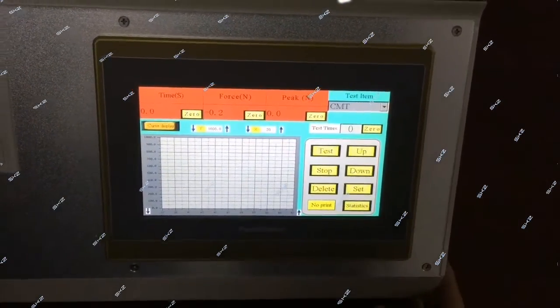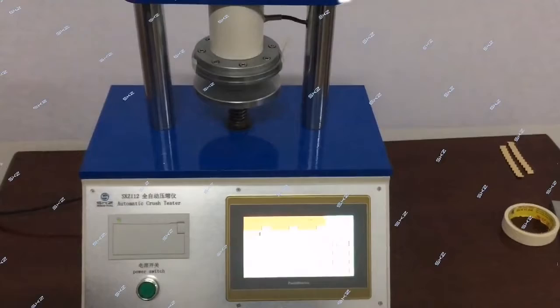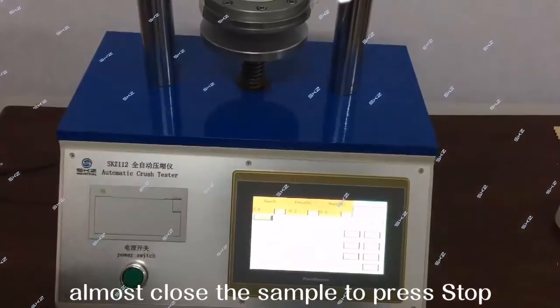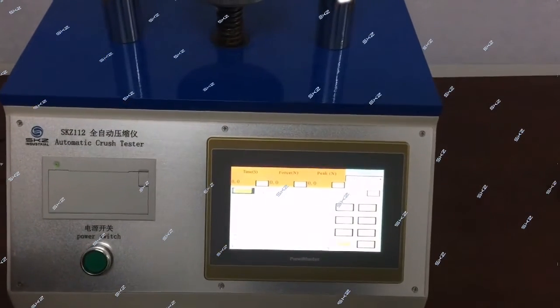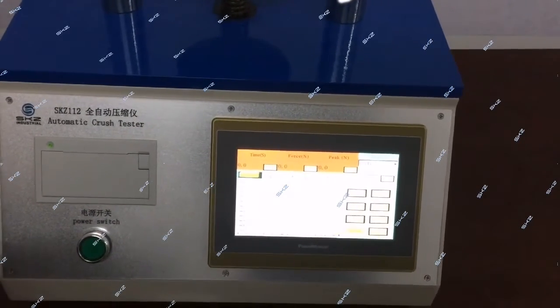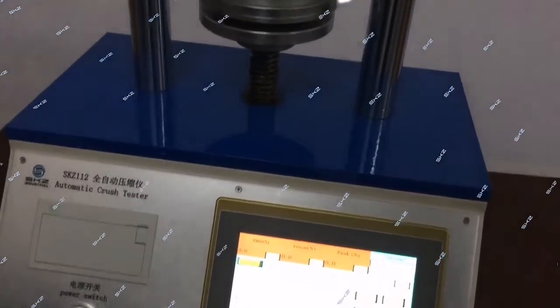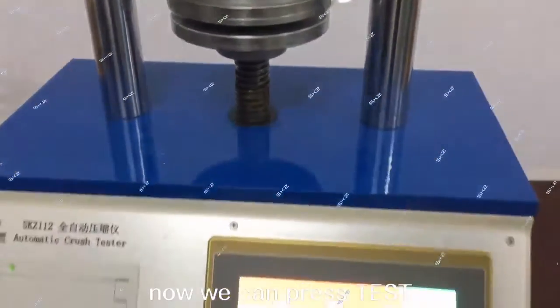Choose the CMT. Almost close the sample to press Stop. Now we can press test.